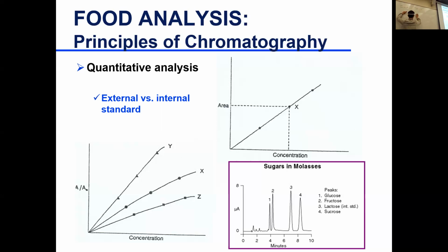And also in my sample, I add my internal standard, whatever it is. So I add it to my standard, I add it to my sample. So now I have internal standards in both. And then I run them separately. I run my samples, I run my standards.